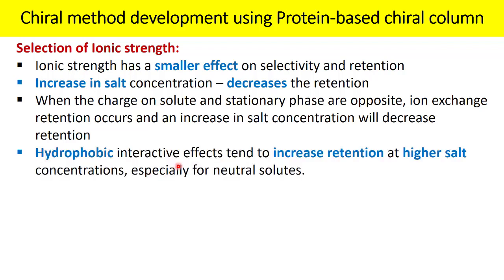Hydrophobic interactive effects tend to increase retention at higher salt concentration, especially for neutral solutes. So this is the way I think you can understand what information you must gather about your molecule, about your column, and what precautions you must take, how you can select your column based on the analyte's chemistry, how one can select pH, how one can select the organic modifier, and even how you can think about the concentration of your buffer salt. Thank you so much.